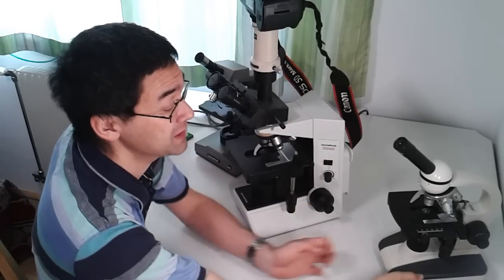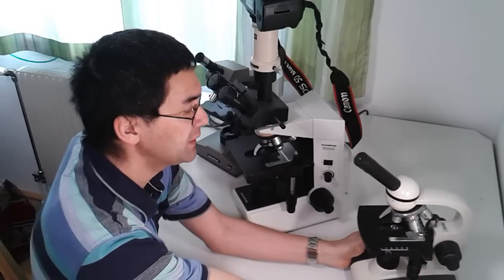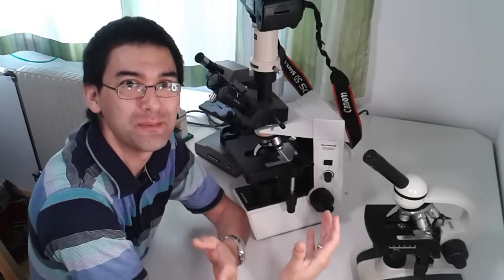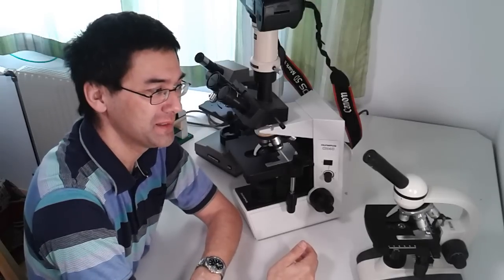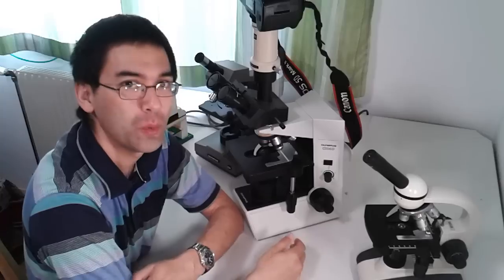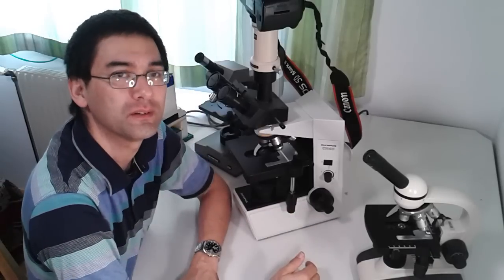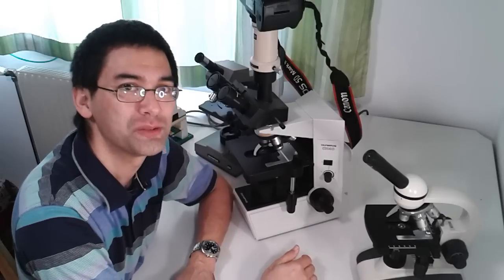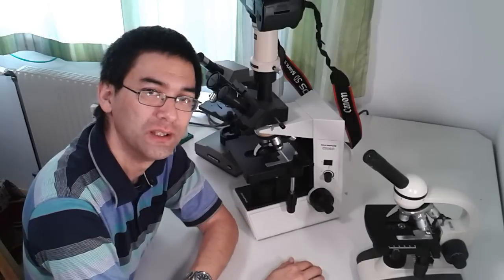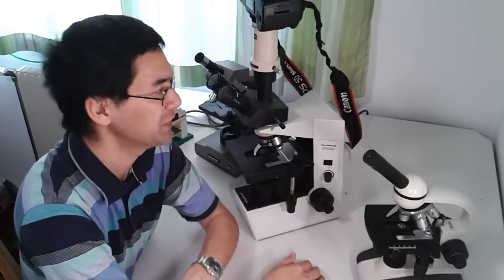All these factors contributed to why I invested significantly more money in the CH40. Don't forget it costs more than 10 times compared to the educational microscope. But I'm going to show you that the image quality is not necessarily 10 times better — you don't see 10 times more because you pay 10 times more. The point of this video is: don't wait until you have money for a really expensive microscope. Just get started with a low-cost one — but not too low.